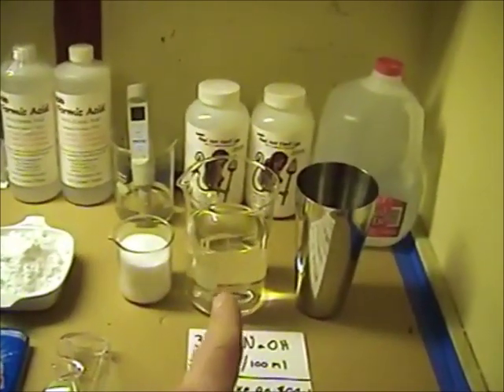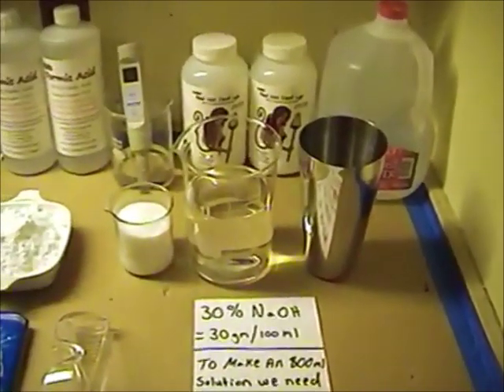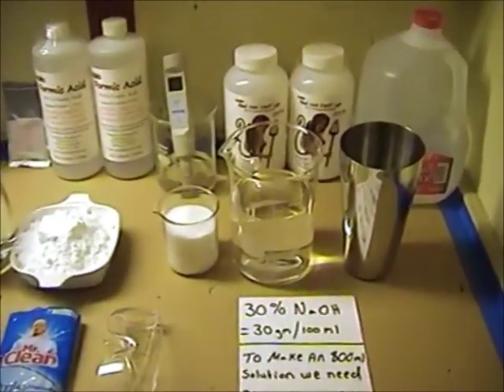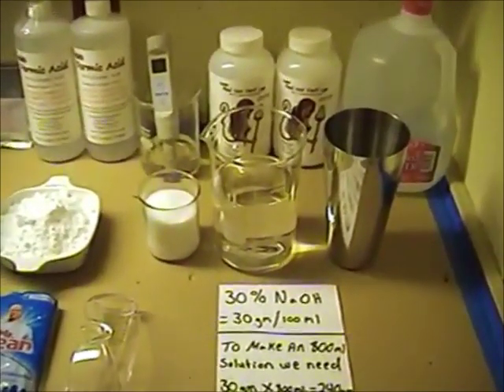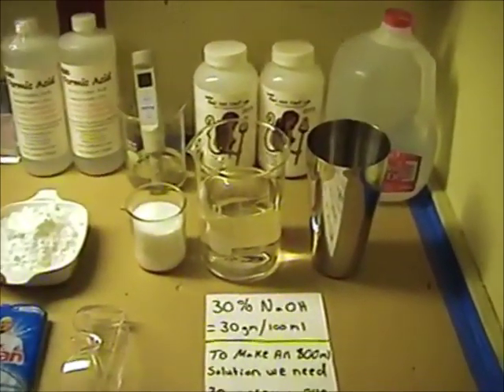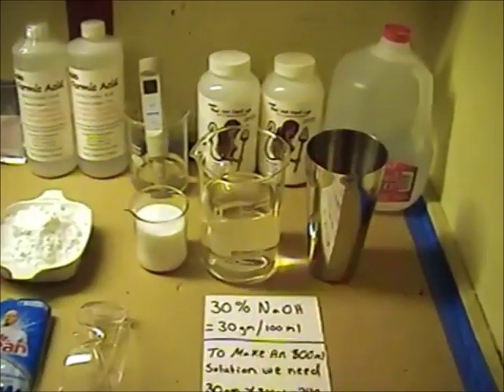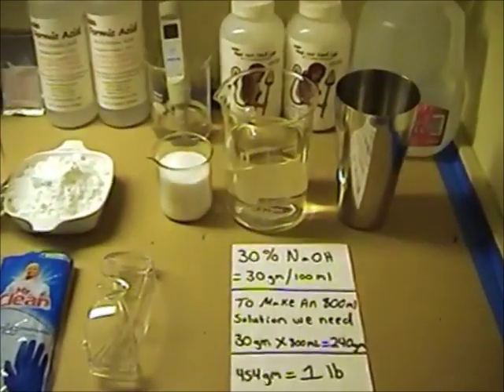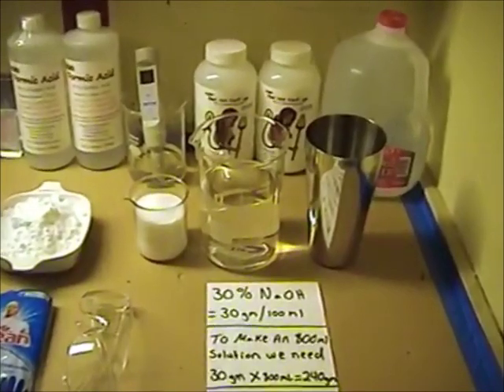So I'm going to pour this water from this beaker over into this. It's a milkshake cup is what it is. It holds 1,000 milliliters of water. There's 800 milliliters in that beaker. Now first I'm going to pour the water over into stainless and add the sodium hydroxide. Sodium hydroxide will generate a lot of heat on its own, just like adding sulfuric acid and water. So what we're going to do is pour the water into the stainless mixer, add the sodium hydroxide, and then raise the heat and allow it to dissolve into solution and cool back off.